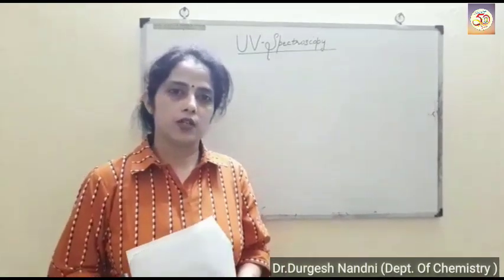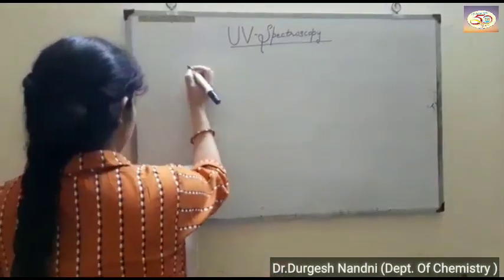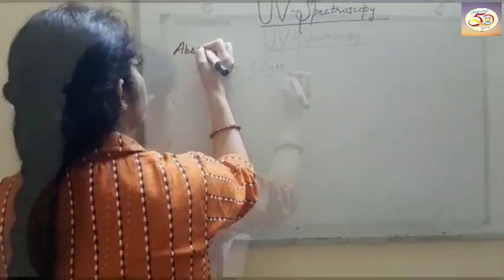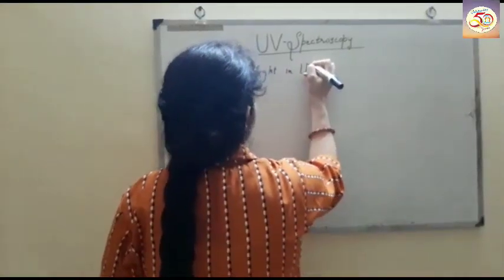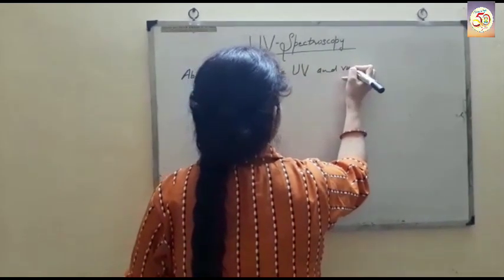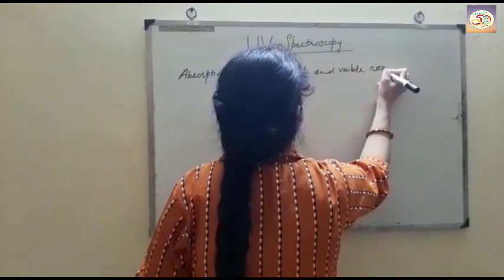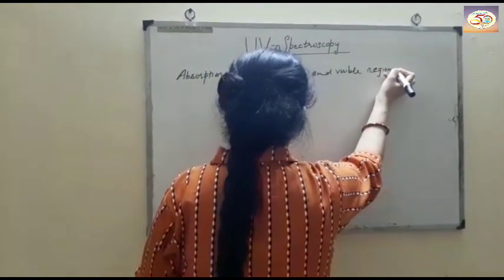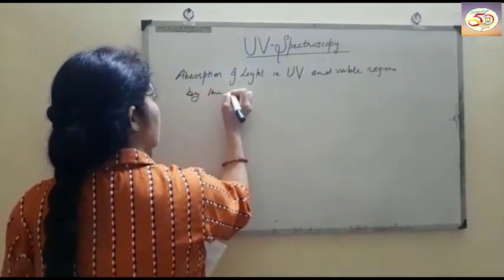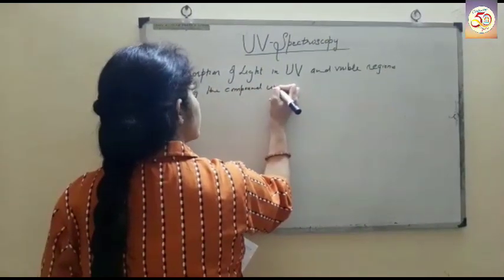Students, in this lecture we will study UV spectroscopy. UV spectroscopy involves absorption of light in the UV and visible region by the compounds under investigation.